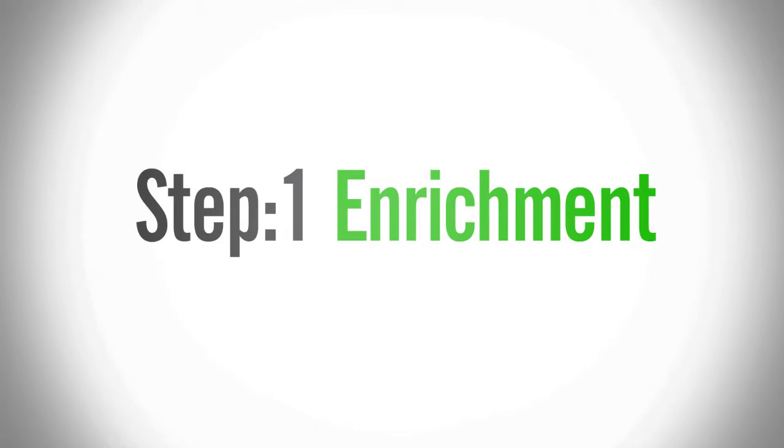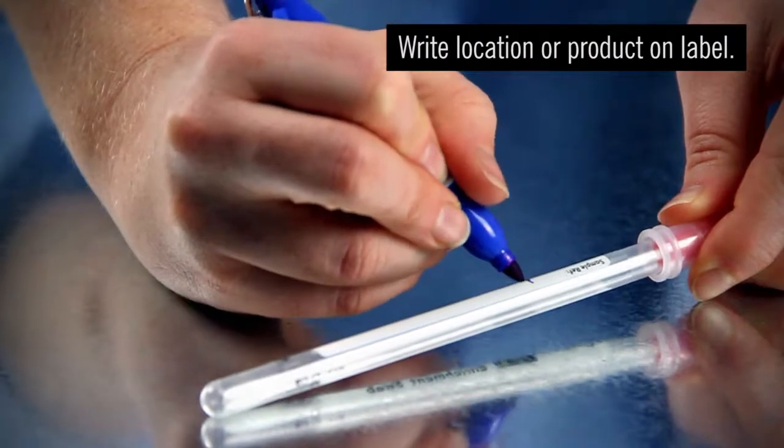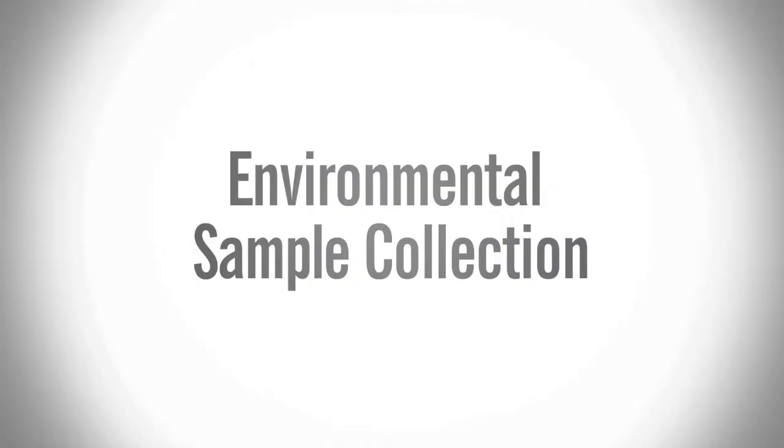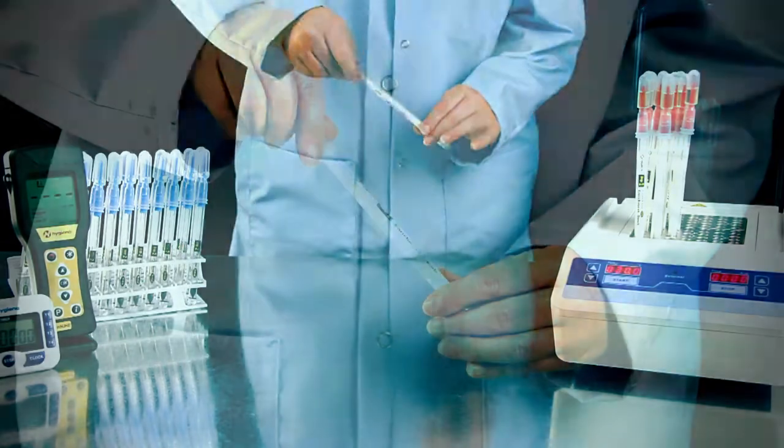MicroSnap is a two-step test. The first step is the enrichment step. Write the location or product on the swab tube label for easy identification. For environmental samples, you may collect a sample just like you would with an ATP test. Remove the swab from the enrichment device.